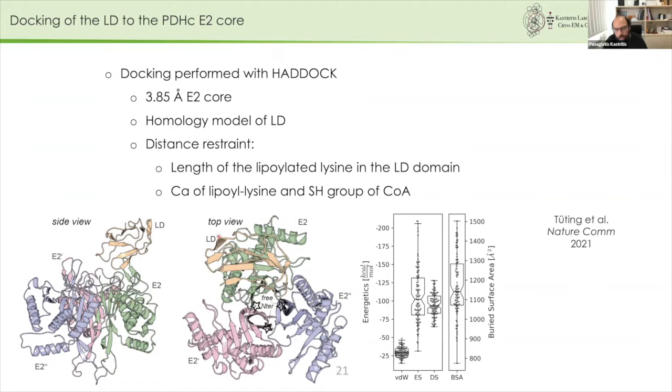We docked this by knowing the biochemical restraint of where the lipoylated lysine should insert into the active site. And we tried to understand what the interface is like, what kind of non-covalent interactions exist, like its buried surface area, and how this compares, for example, to other transient interactions.